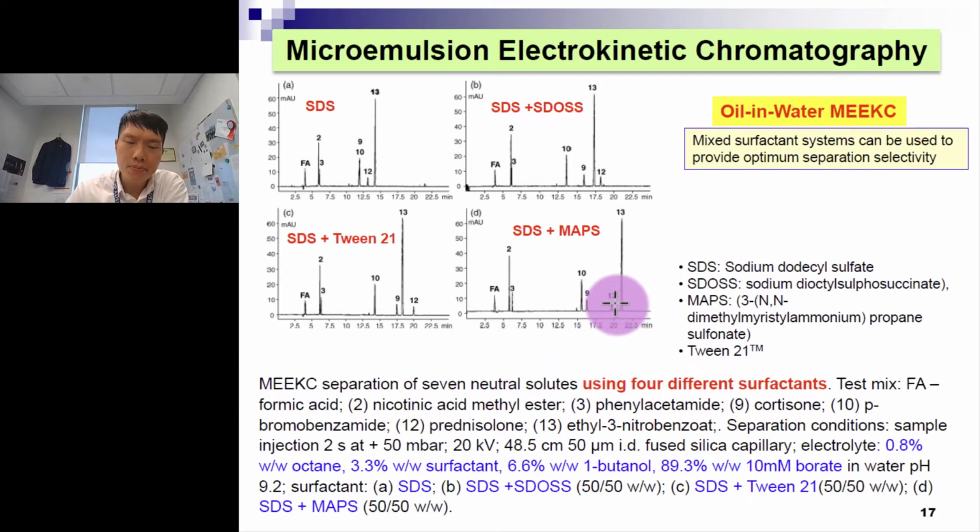So why does it matter? What if we are trying to isolate a certain particle that's of higher percentage here, right? We want to save time. We don't have to stop all the way until every single part of the mixture has been eluted.